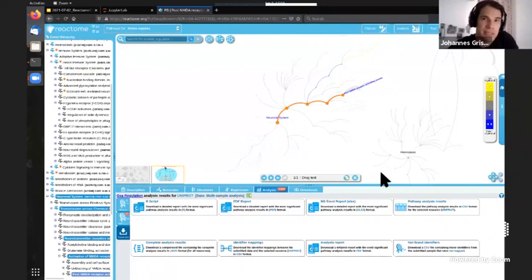And every 3 months, a new release is out, and you will get slightly different pathway results, because a new release means the curators are working non-stop, new pathways are curated, some probably with more details, and of course this changes your stats. So if you need reproducible results because you're working on a paper and you want to update your figures, keep that in mind, that you somehow store your result using one of these options.